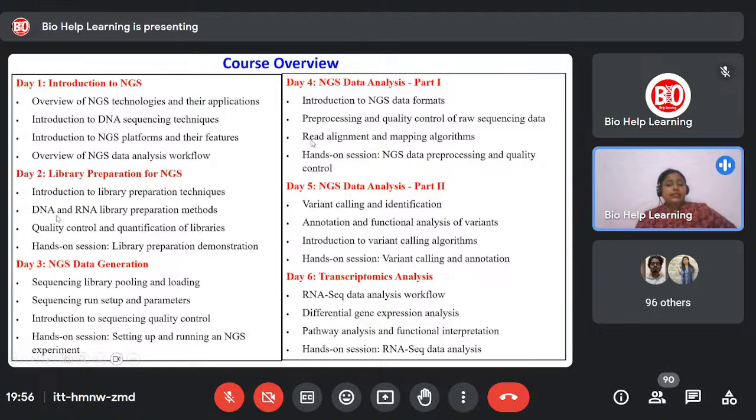Now, fourth one is the very important hands-on session starting. Here you can learn various file formats of NGS data analysis, and how we can proceed with NGS data pre-processing and quality control using R language and various online available software and tools, which I will explain in this course.